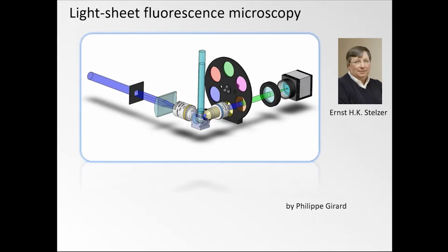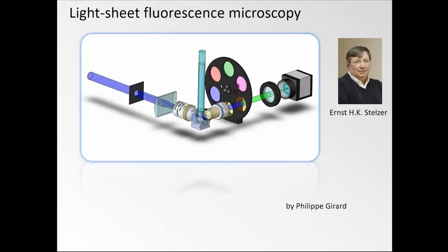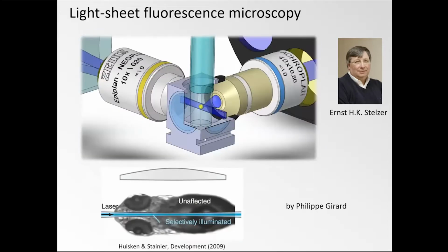And if you look, what's the trick of the light sheet microscope? Somewhere here, this capillary is the sample. So if you zoom in, the idea is basically that with one objective, you create a sheet of light that illuminates this sample here in yellow, and it illuminates a slice of it, and that excited slice is then imaged with a second objective onto a scientific camera. In principle, very simple, or at least in that form.